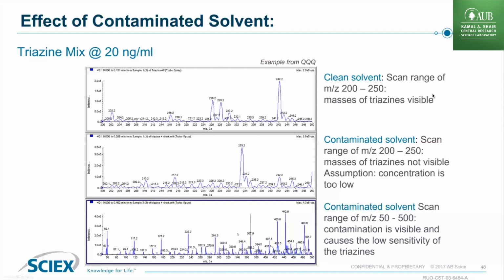They're equal distance. And I think if we pulled out a calculator and we did the mass difference, we'd see that it's the same subunit. So what is that? That is a polymer. We see masses like that of all the same difference throughout the mass range. That is a polymer that has gotten into your solvent.